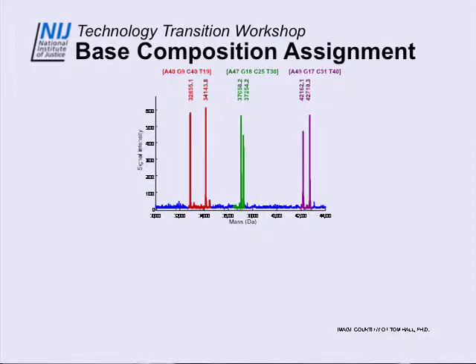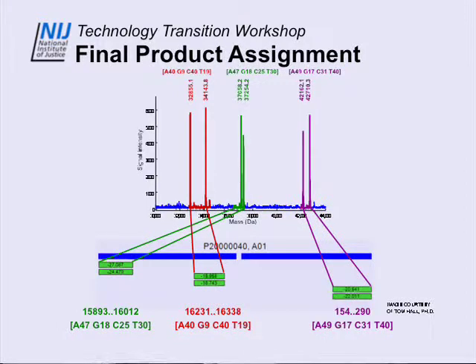We know a little bit more than that, because we know the PCR primers we put in, and we know how we selected them against an alignment of mitochondrial DNAs relative to a reference, and that reference has exact coordinates. It's the Cambridge reference sequence. A particular position in the Cambridge reference sequence can always be used to reference the beginning and ending of a PCR amplicon.